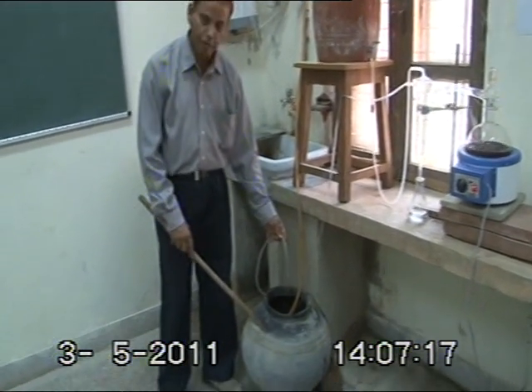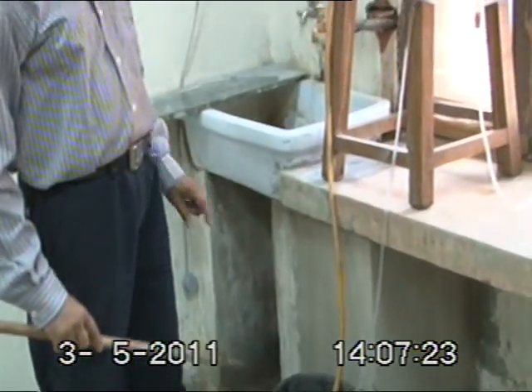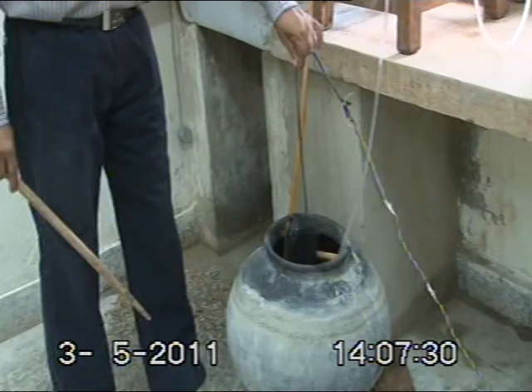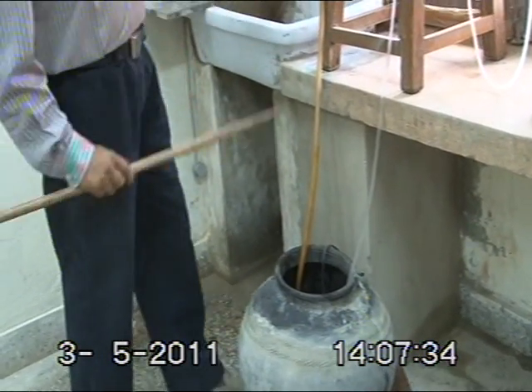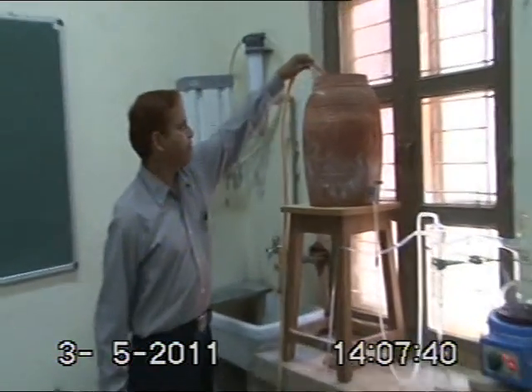The water gets cool very comfortably in the earthen pot, and then this water is recycled — it is pumped back to the upper tank through a motor. This is a small submersible motor that is pumping the water from this container back to this tank. I can show you how the water is going into the tank.